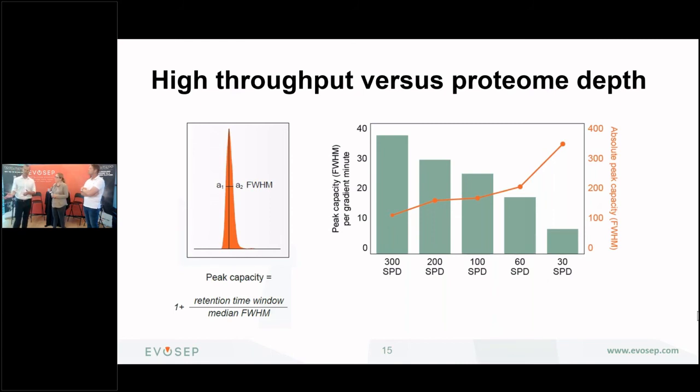Obviously, back in the time, the duty cycle for one MSMS was 2 seconds, right? The cycle time was 6 or 7 seconds, and it was MS of the three most abundant peaks. That would never work on these things, right? Now we're doing completely different workflows. So I hope this is a trend, and that next year we'll see even faster and more sensitive mass specs, and that's definitely going to help the argument for shorter gradients.